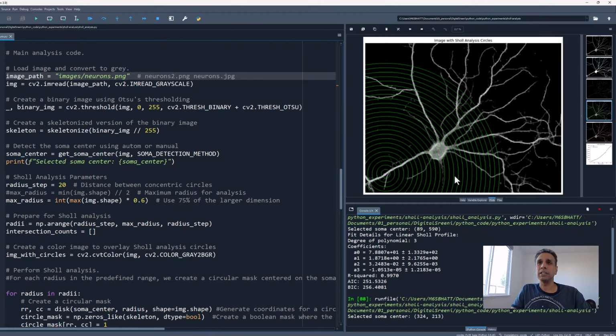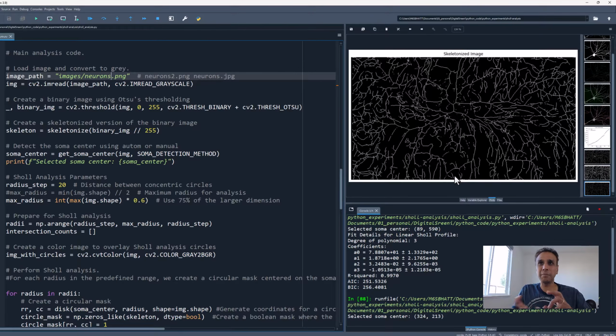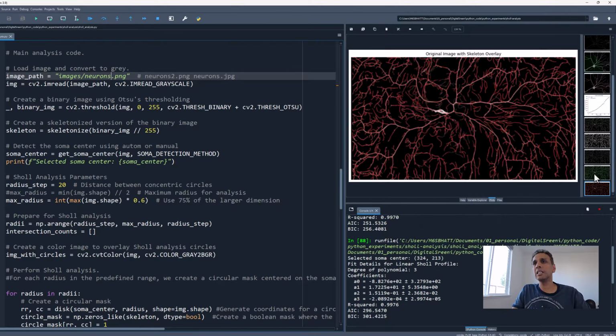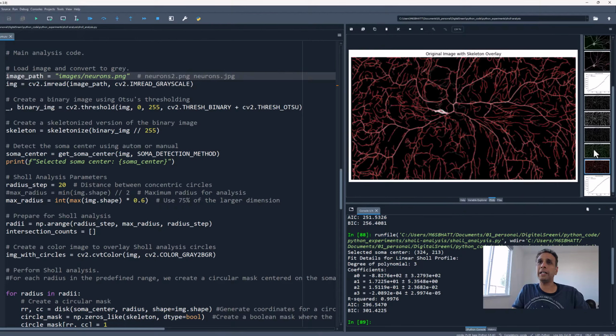Let's go ahead and run this. I want you to see how there is some limitation with a manual process. This is a different image. Oh, it actually did not do a bad job identifying the center. Oh, let's go back. Identifying the center of this Soma.